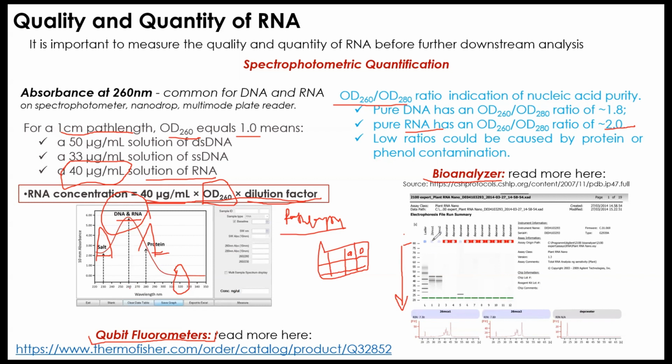For example, here I am giving you one of my samples from when I was doing it earlier, and you can see that there are two distinct bands. One is here, and the other one is here, right? In between, you have some more very light thin bands, but those could also be because of the chloroplast and mitochondrial DNA and the RNA or nucleic acid contributing to it. But majorly, you will get these two, right?